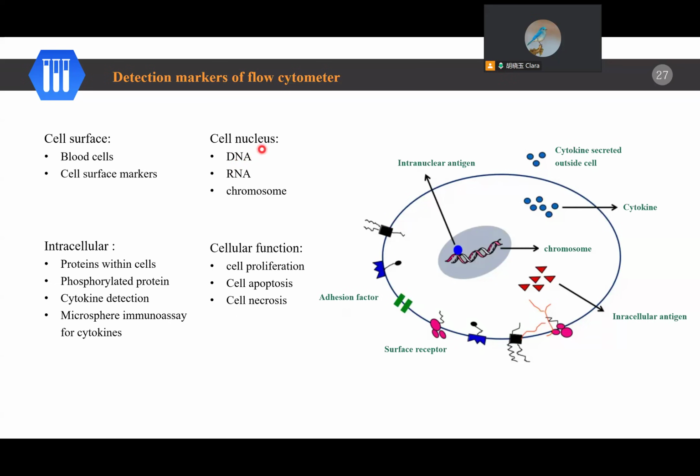And I need some fluorochrome too. So if I can find a reagent that has two components, we can stain and detect by the machine.